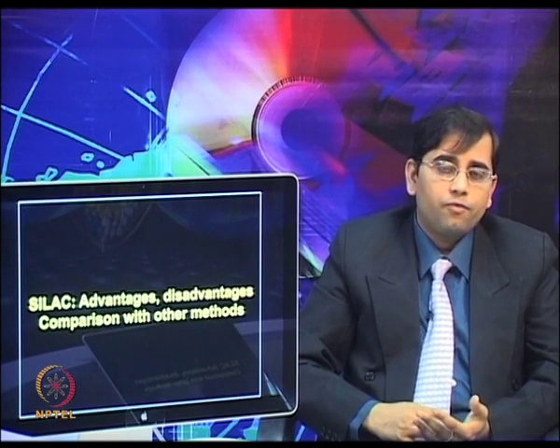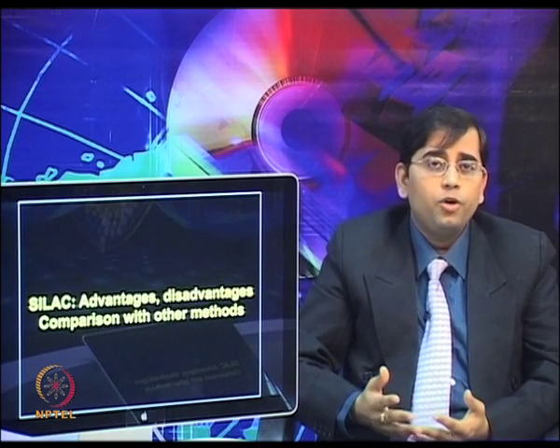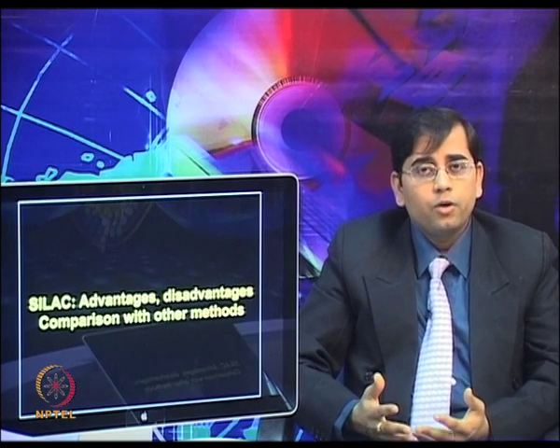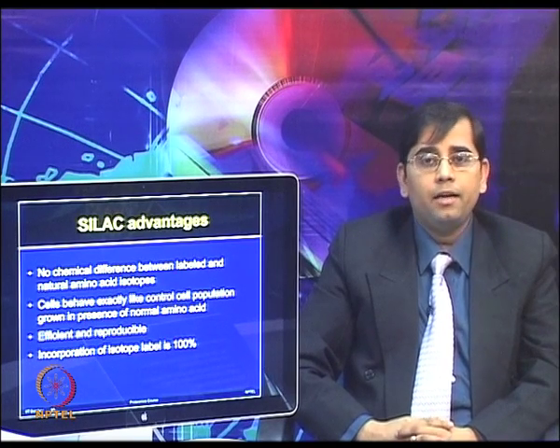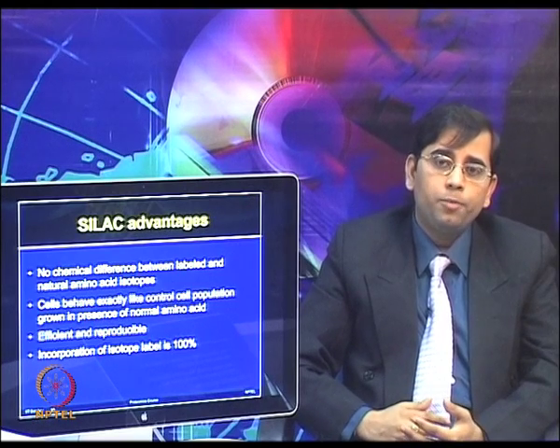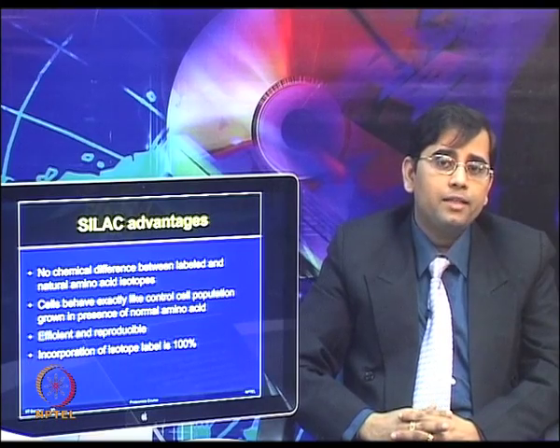Studies such as the subproteome analysis, for example, of cellular organelles or complex purification protocols, can also be performed with very good quantitative accuracy by using this method. So, let us discuss some of the advantages of using SILAC method. In SILAC, no chemical difference is observed between the labeled and natural amino acid isotopes.